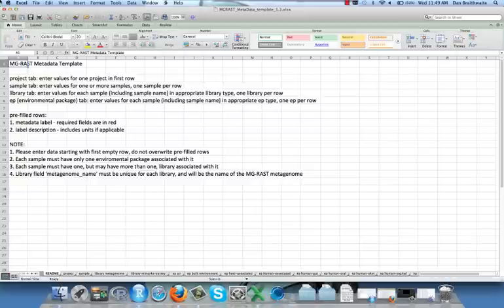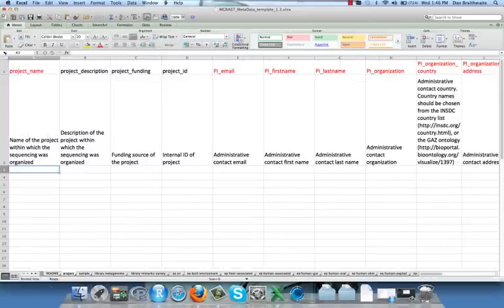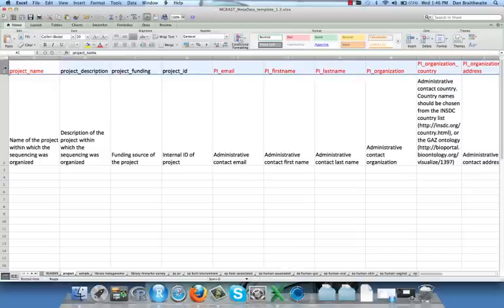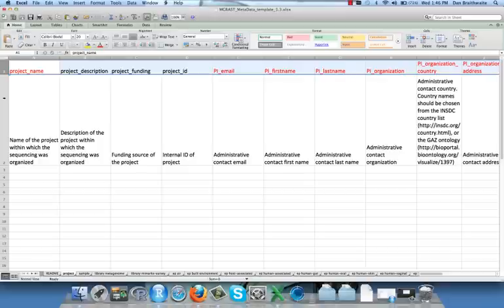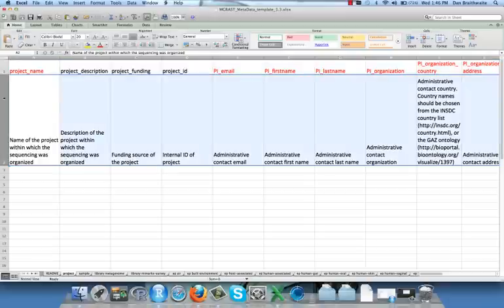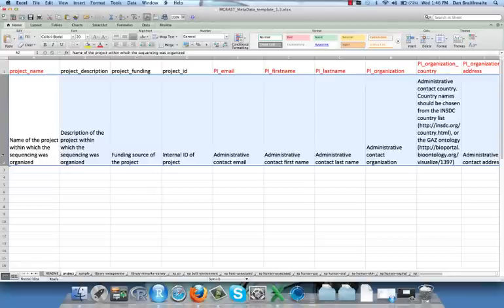Now we move to the PROJECT sheet. In this sheet and all the others, field labels occupy the first row, and required fields are indicated in red color. The second row gives a further explanation of each field, including format instructions.